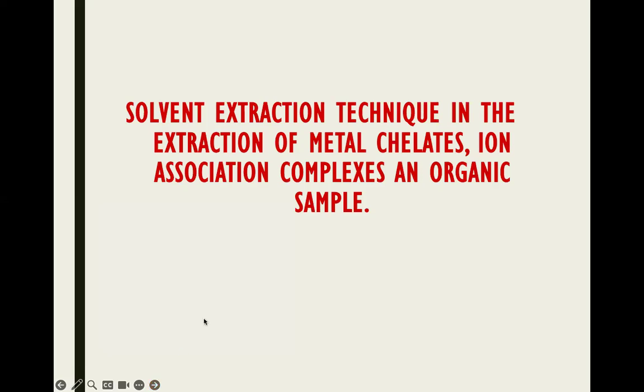Just now we were talking about organic compounds, usually polar organic compounds like caffeine, vitamins, and the active component in a drug. Just now it was paracetamol. So what about metal? What about metal extraction? How do we extract metal from the aqueous form?